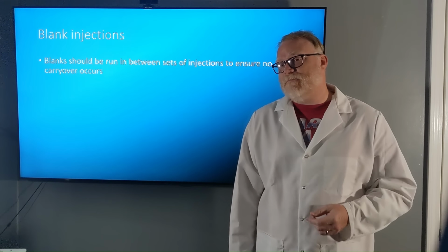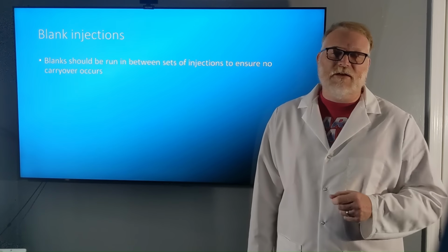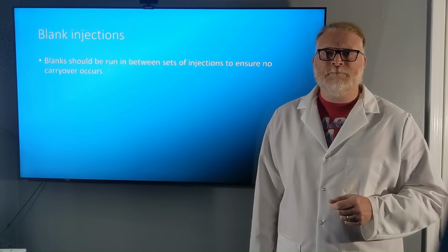And then finally, it's good practice to end with a blank just to make sure that the system is clean for the next user. We don't want to leave that dirty.